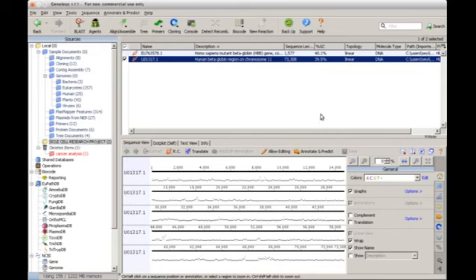Now as you can see, the total number of the sequence here is 73,308 nucleotide bases in this sequence. So that's the first thing you do. The first thing you do is understand the total number of nucleotide bases in this sequence. That's the first thing you do.